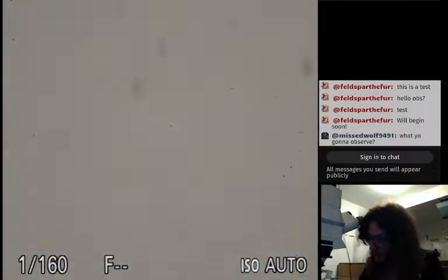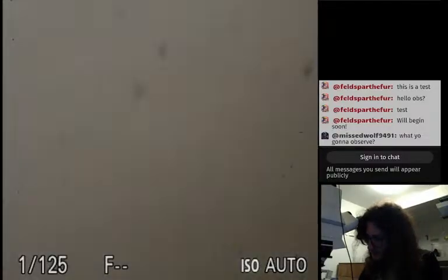Much water in the bottom is sticking to the tray thing. And zooming in. To the left.